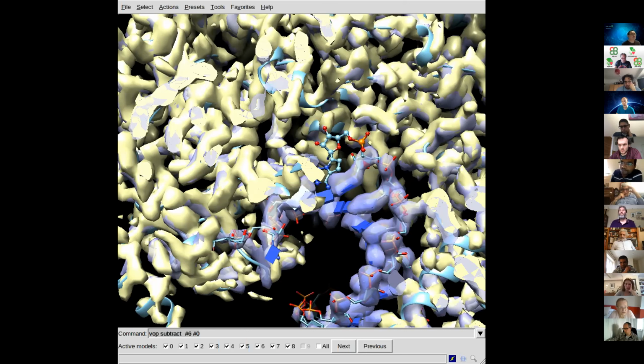A while ago, in one of our previous meetings, I was saying that if the original images were differently normalized, for example some slightly positive, some where the average density should be equal to 0, and it depends on how far images went from the focus, the balance of the low frequencies and high frequencies. It's quite a lot of trouble. That's exactly why this issue related to the scaling of density is extremely important.